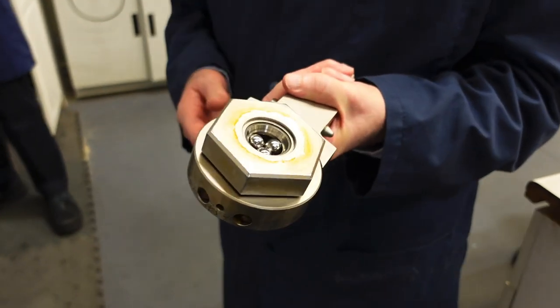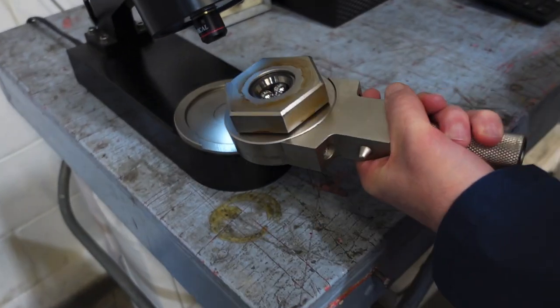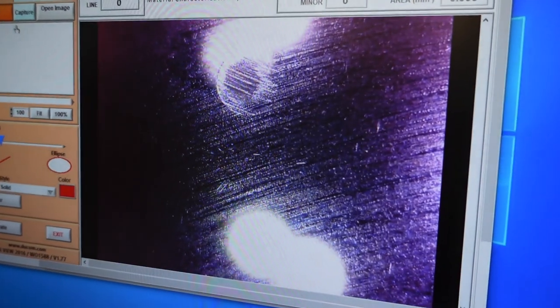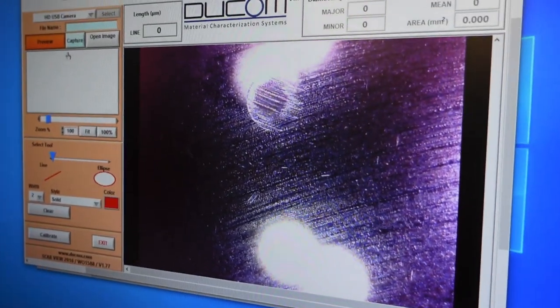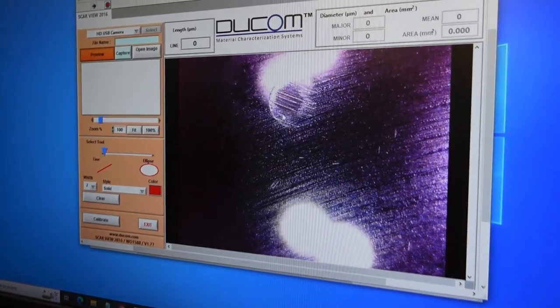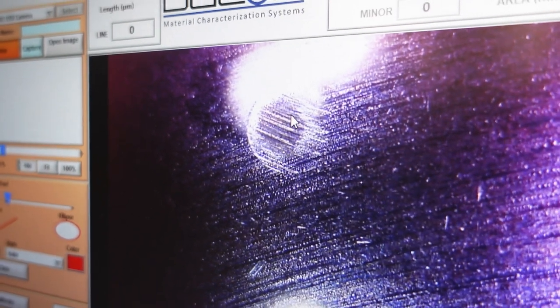You can see the balls will drain the liquid off. You can see that there's no smoking and there's very little damage. Yes, we're going to actually measure the scar on the balls. They're so small that you really can't see them easily with just your naked eye. So we have a special microscope that we're going to use to look at the scar diameter and what the scar looks like. We're going to put it into the microscope and set our software to be able to look at it. With the naked eye, you can't even really see it — I can't see it and I have good eyesight.